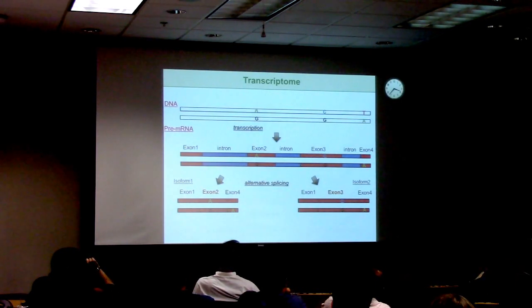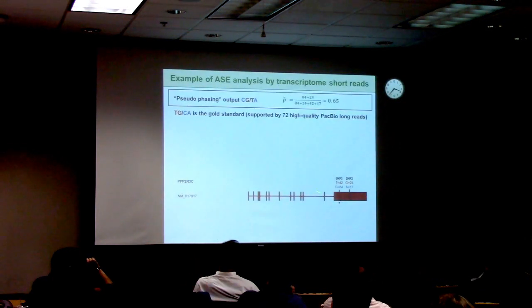Then we come back to these questions. When we only consider this isoform, originally in the annotation library, we only have one isoform annotated in the library.